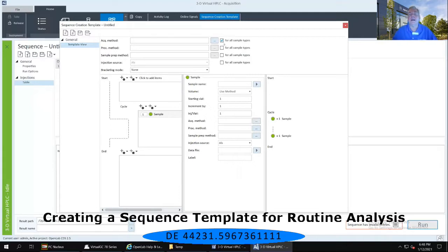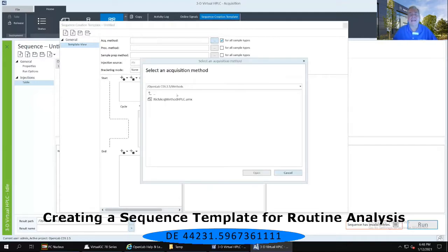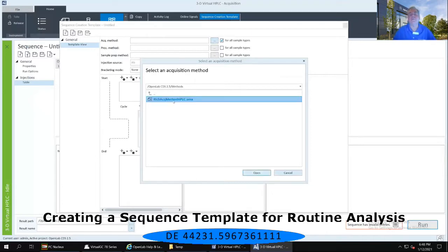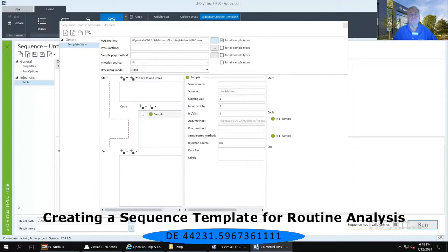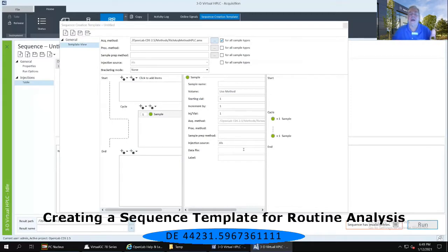Now I can select those three dots. My AMX method, which I created several steps back, I select and open. Now immediately below those lists of things — the acquisition method, processing method, sample prep method, injection source, and bracketing mode — I have a series of three panels.